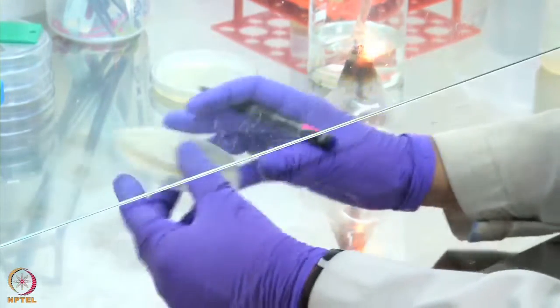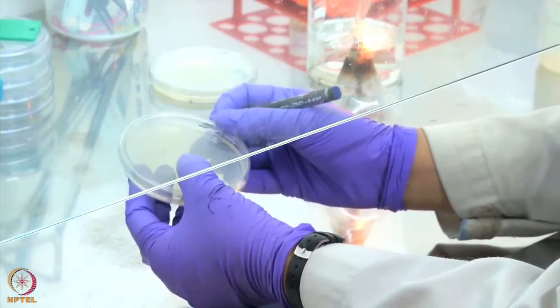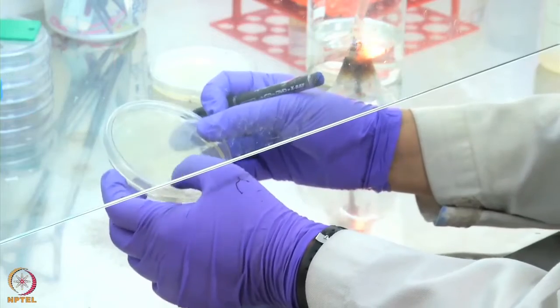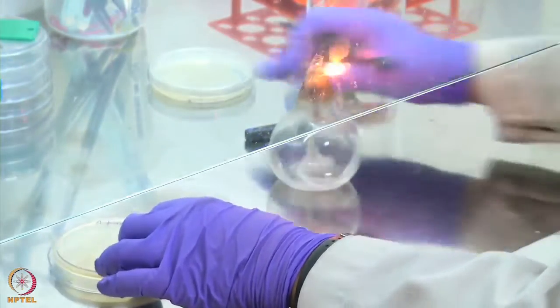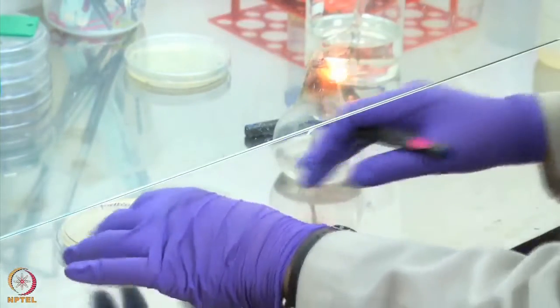Normally we keep the plates this way, upside down. Otherwise, if we keep them like this, because of the loose ends, we may end up having some sort of contamination. So usually we keep them upside down. Right now I have done plating, so for some time I will keep it like this, the straight way. Later I will keep it upside down as well.